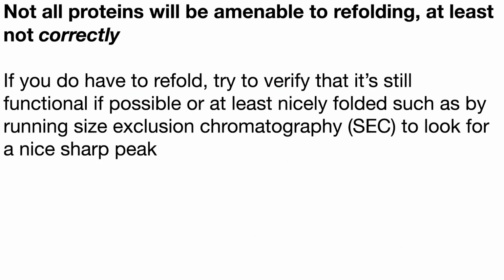So if you do have to refold, maybe you get it to come back into solution, but it still might be kind of messed up. So try to verify that it's still functional if possible. If it's an enzyme, see if it can still perform whatever enzymatic function it was supposed to do, or at least try to see if it's actually nicely folded.